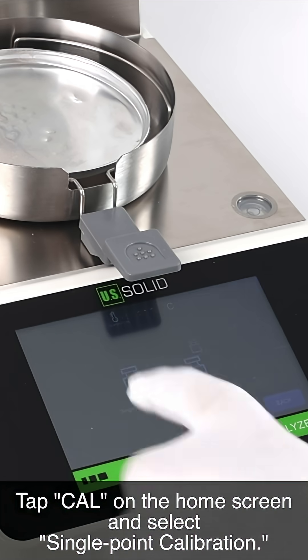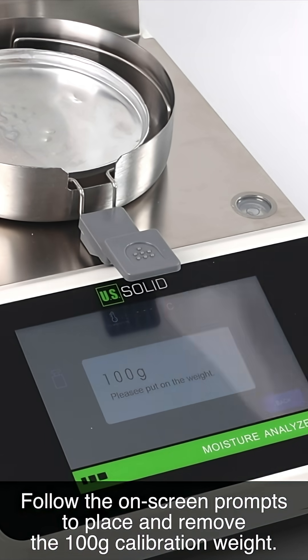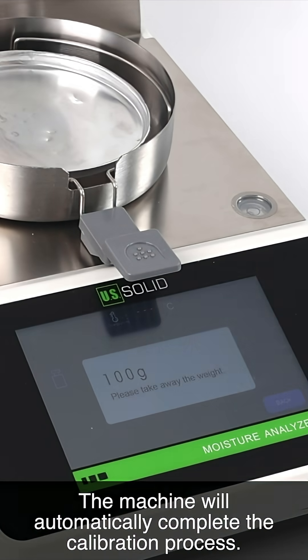Tap calibration on the home screen and select single-point calibration. Follow the on-screen prompts to place and remove the 100 grams calibration weight. The machine will automatically complete the calibration process.